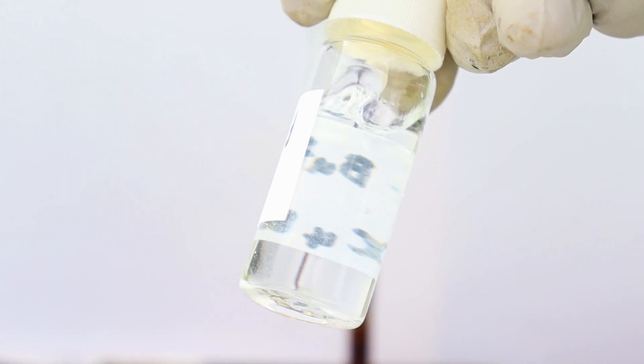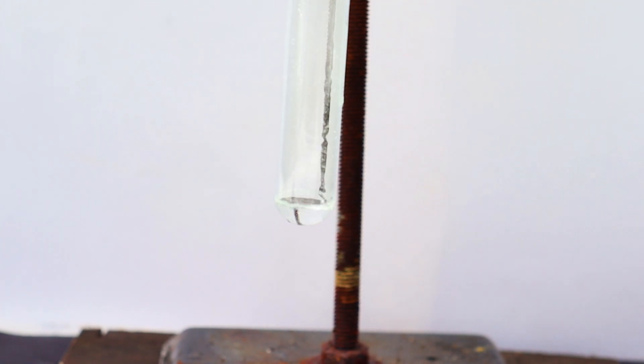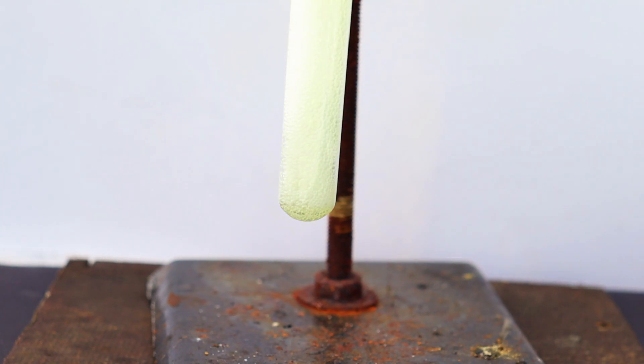Up next we have the reaction with tert-butyl chloride, which was made ourselves. It just turned green and began to boil. If you have any ideas about what could be the products of this reaction, feel free to write in the comments. The next reaction is a bit different — it's a reaction between some bleach and fuming nitric acid. It produced a whole lot of chlorine and sodium nitrate.